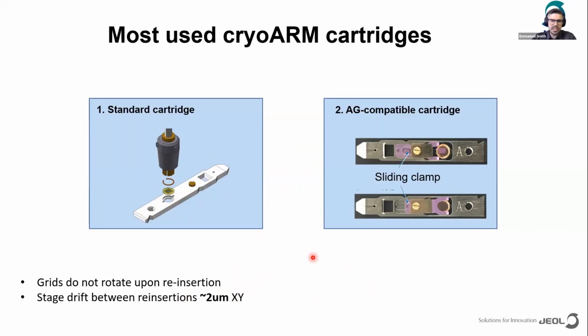So when you're doing atlasing and you're taking your square images, you do not need a realignment routine. So you can really streamline the initial steps in setting up a data collection.